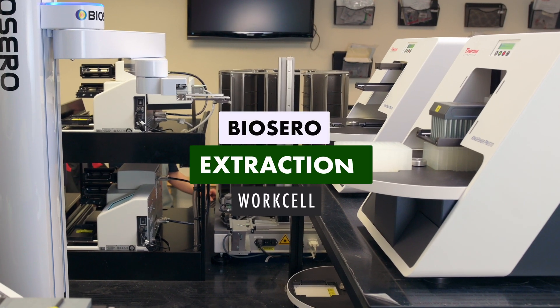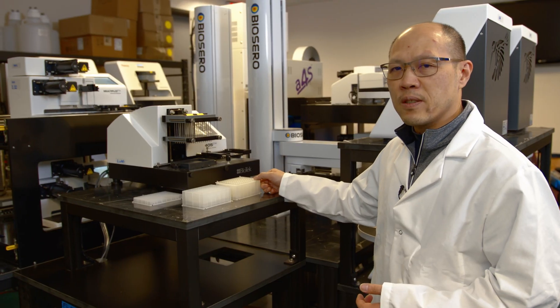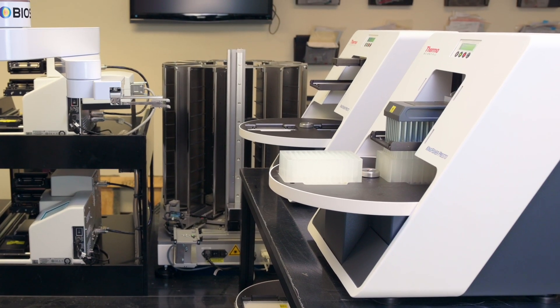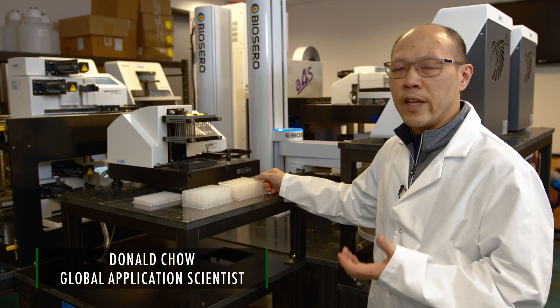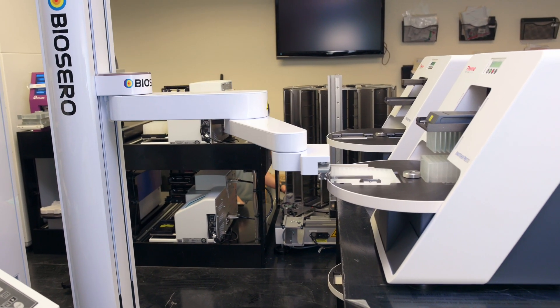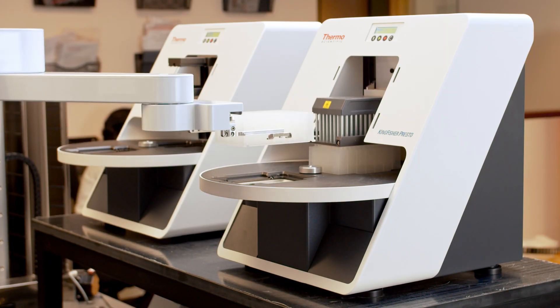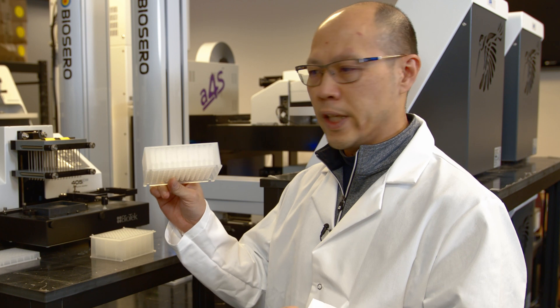This particular work cell here is the start for the whole workflow. Samples that are taken from patients to purify of the viral RNA that may be present. As samples are provided to the testing facility, they are transferred into each well of this particular plate here.